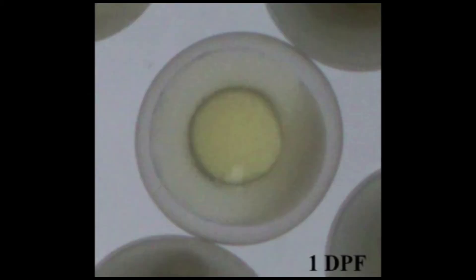In the first stage, around 24 hours post-fertilization, a cell cap develops shown in the lower right corner of the egg. Most of the egg consists of yolk and a centrally located oil droplet, shown in yellow.